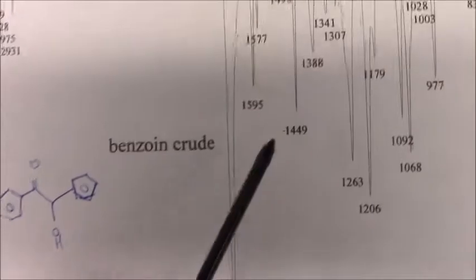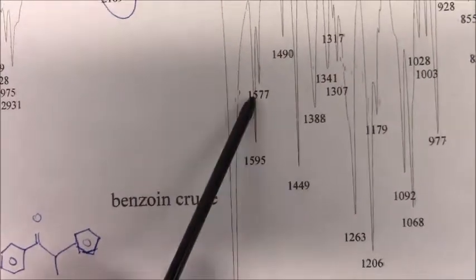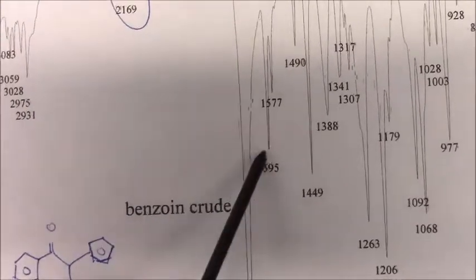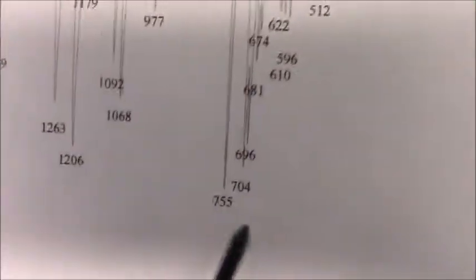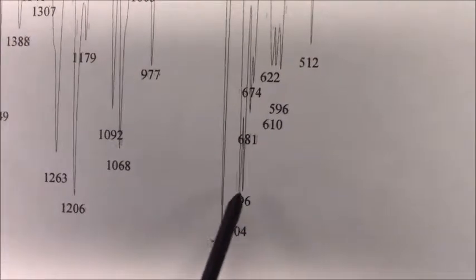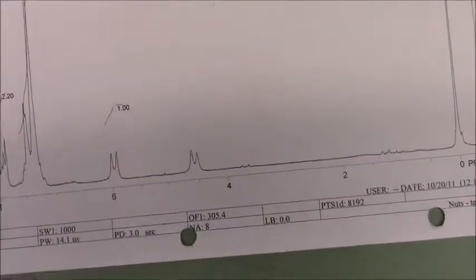You get two aromatic rings, so obviously, as usual, right around 1600, this, and even this. Normally we circle it just like Pavia. Say aromatic ring stretch or carbon double bond carbon stretch. And then we look for any potential mono, and you can see how you've got a couple here. You can circle this and just say mono substituted aromatic rings out of plane bend. So that's IR. Now we move on to the proton.